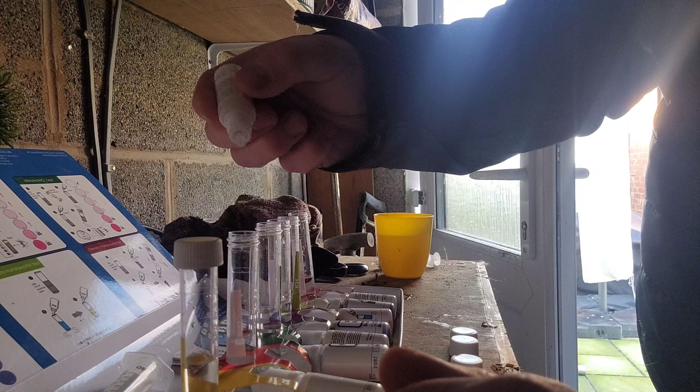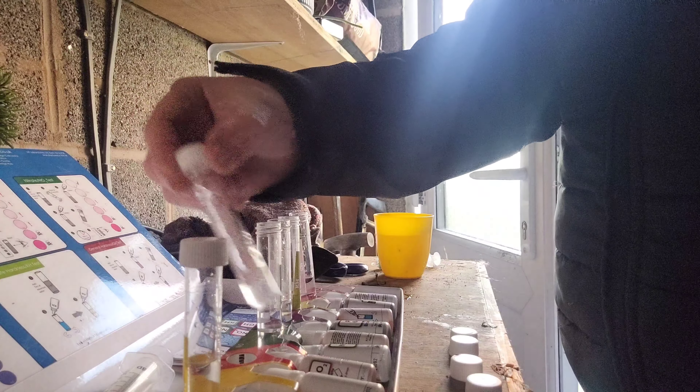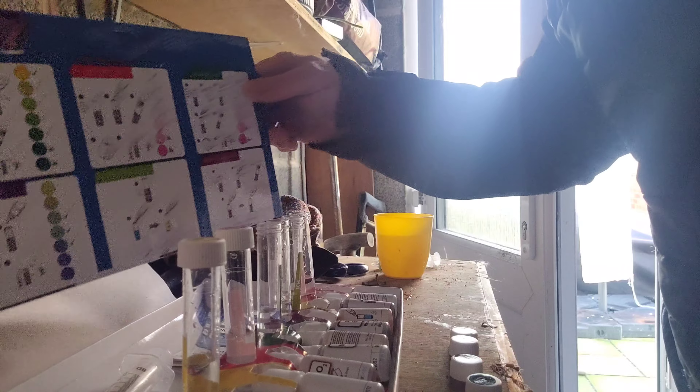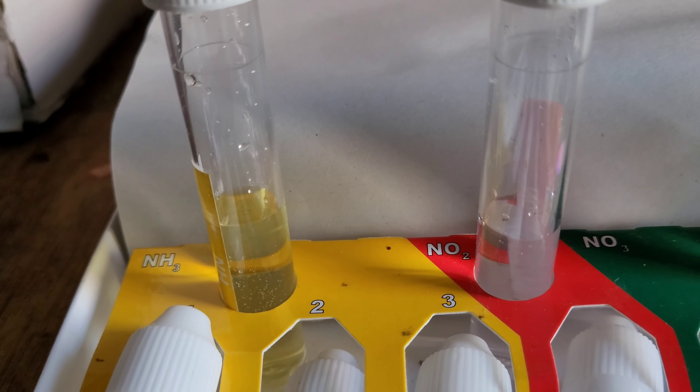Ammonia is done — I'll wait 10 minutes for that one. Counting drops again: one, two, three, four, five. So I've followed the instructions on the back. They're all done now and they look pretty excellent — that's ammonia, nitrate, and nitrite all done.